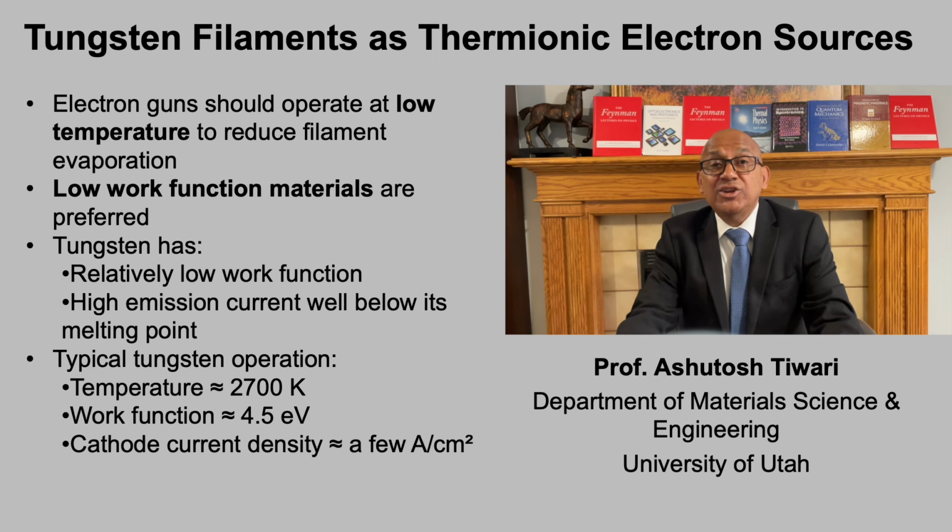This level of emission is sufficient for many SEM applications, especially where cost and robustness are important. However, the need for such high temperatures also explains the limitations of tungsten sources, particularly in emitter lifetime and ultimate beam performance. This motivates the use of alternative materials with even lower work functions, which we will discuss next.